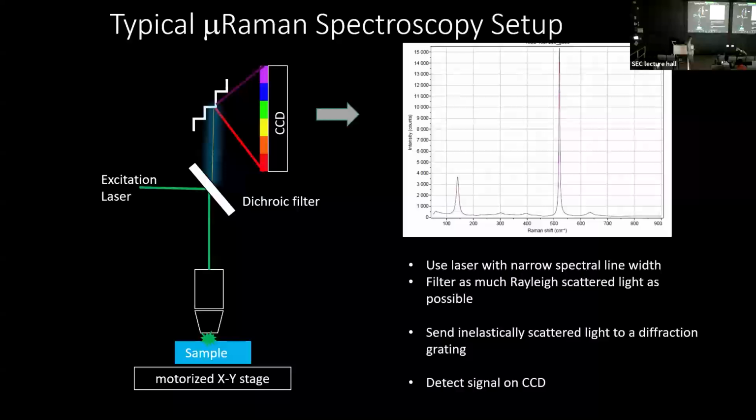They go at the Center for Nanoscale Systems. I have lots of small samples come in, so I run everything through a microscope. The light goes down, interacts with the sample. Some of the photons undergo this inelastic light scattering and change wavelength because they've lost a quanta of energy to a phonon. We collect all the light back, we send it to a diffraction grating, spread out the light like a rainbow and take a picture of the rainbow.